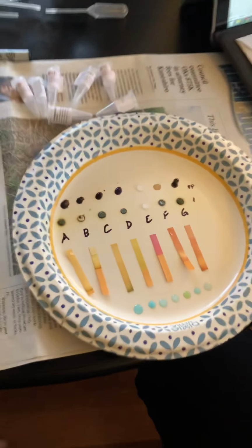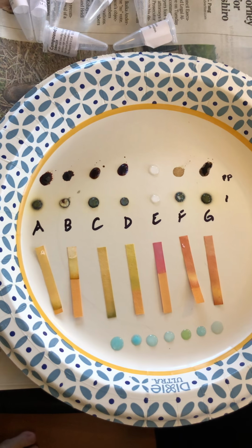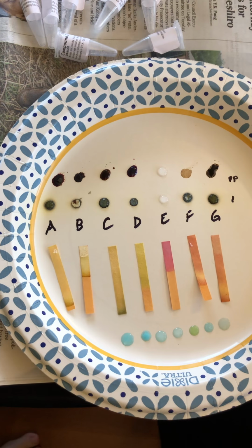Otherwise, for my final results, A turned out to be caffeine, B was thymol, C was xylitol, D was sodium acetate, E was ascorbic acid, F was benzoic acid, and G was salicylic acid.